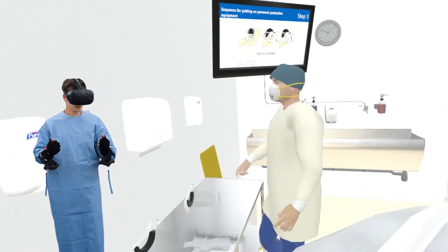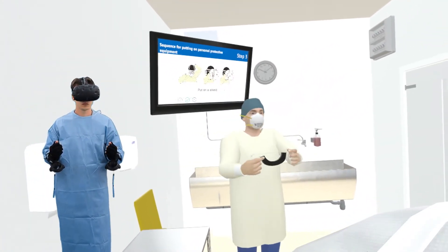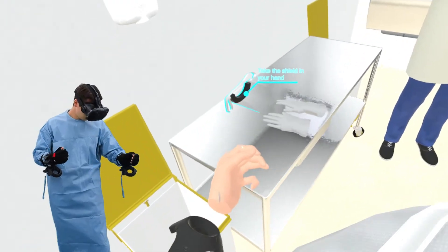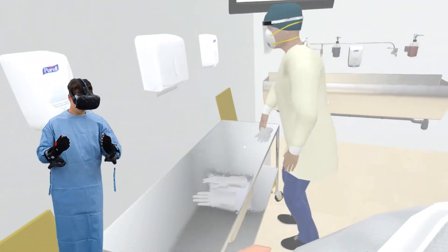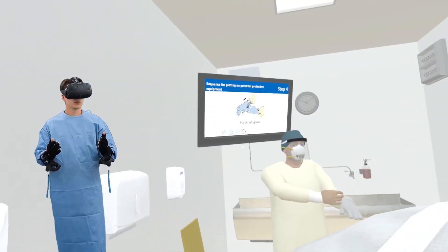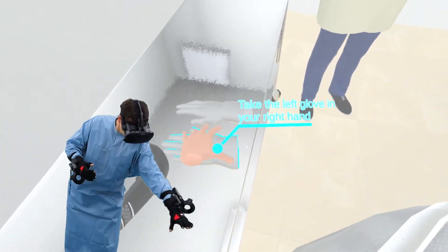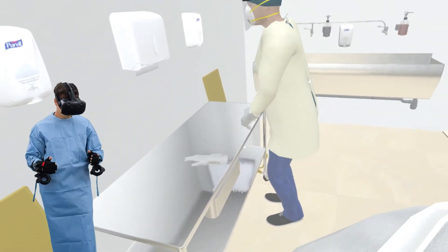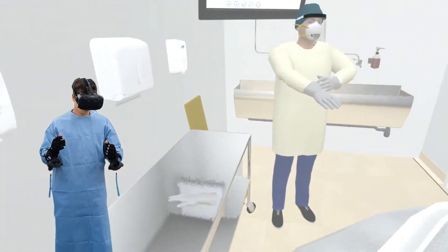Don your face shield by placing the strap at the back of your head. Ensure that the top of the face shield is resting in the middle of your forehead. Put on your gloves. Ensure that gloves are placed over the cuff of the gown so that the skin of your wrist is not exposed. Perform a final personal protective equipment check prior to going into the room. Alternatively, have a colleague perform the final check.